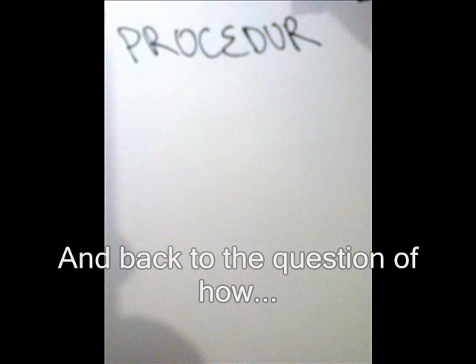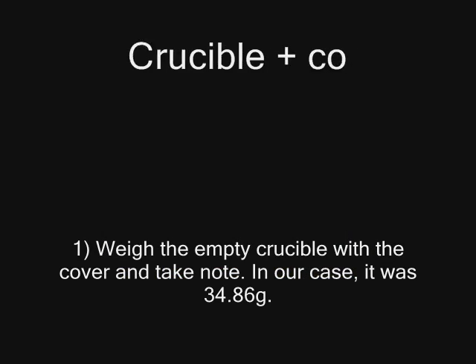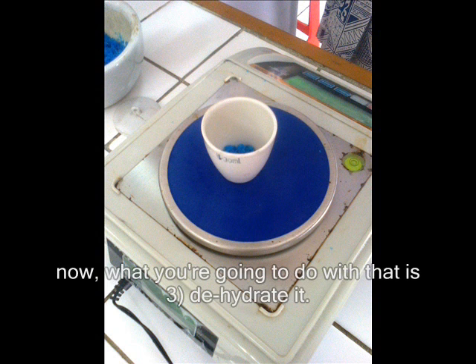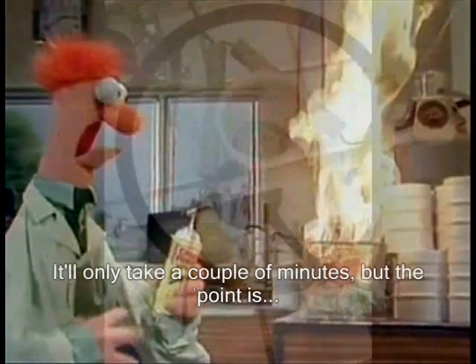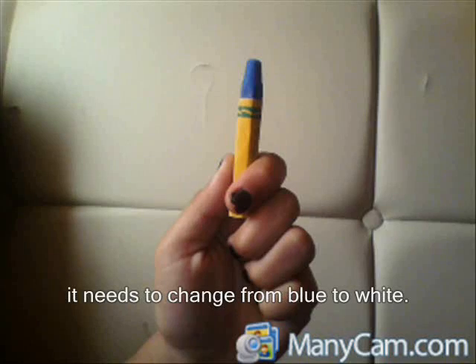And back to the question of how. Weigh the empty crucible with the cover and take note. In our case, it was 34.86 grams. Next, weigh in 1 gram of hydrated copper sulfate. Now what you're going to do with that is dehydrate it — basically, evaporate the water. It'll only take a couple of minutes, but the point is it needs to change from blue to white.